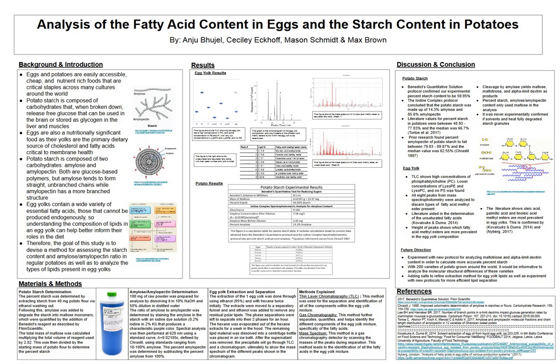So instead, we used the amylase to degrade the starch to maltose, the 40 milligrams of flour that we had to start with, and we used a Benedict's reagent, a colored chemical that turns colorless upon binding to the reducing end of a sugar, to quantify the exact amount of starch present. There's a chart in the results section, which I'll get to in a minute, which shows the exact ratios of mass of maltose that will react with the Benedict's.